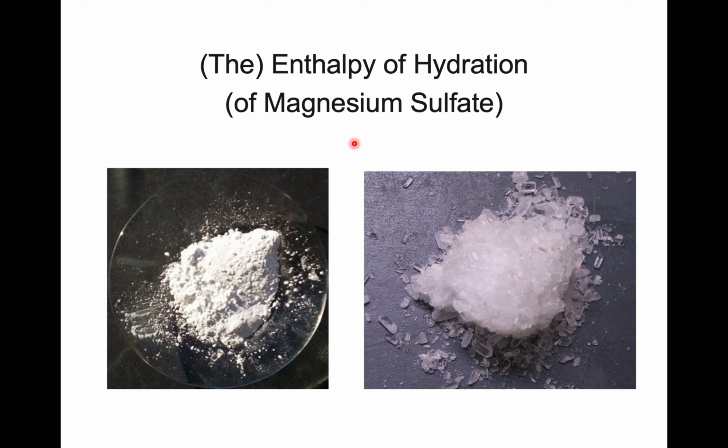Hello everyone, welcome to our final lab for this semester, the pre-lab. We're going to look at the enthalpy of hydration of magnesium sulfate. Here on the left, this is anhydrous magnesium sulfate. It contains no water molecules. It's a very free-flowing powder.